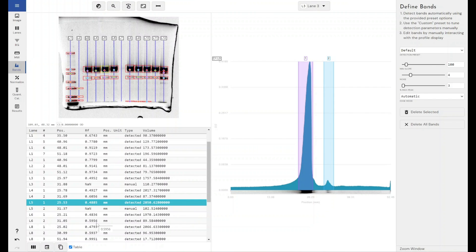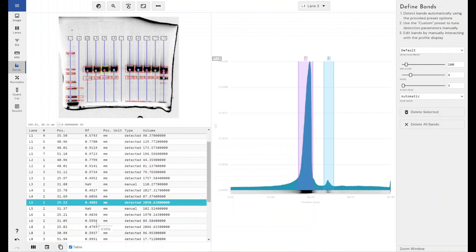Now there are some SOPs out there that use this value, and some protocols that use this value. Molecular weight, including a molecular weight ladder within your experiment, is always going to give you more accurate sizing. But if your particular workflow doesn't cover that, or if you're particularly interested in using the RF value within your experiments, this is how you would access that.